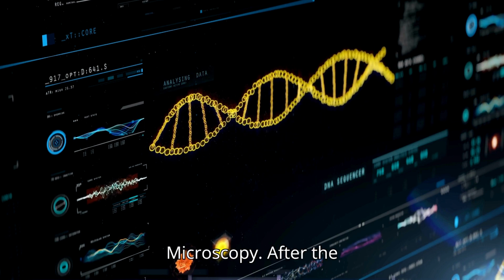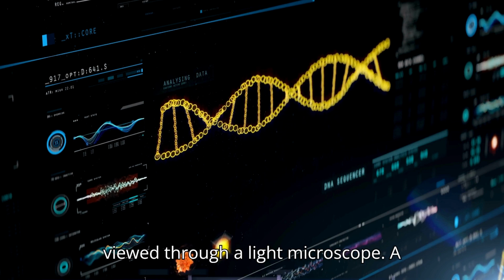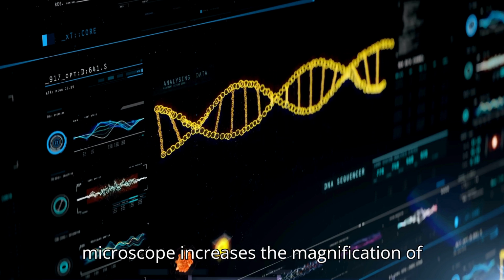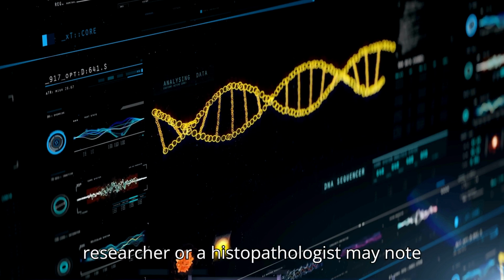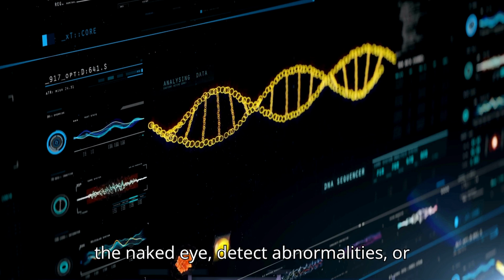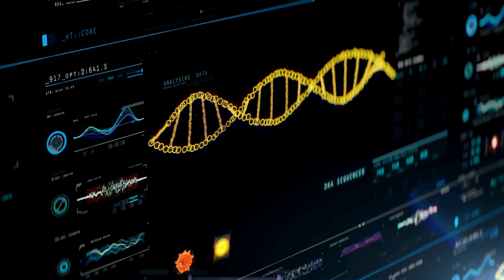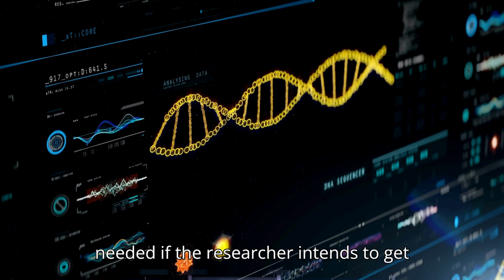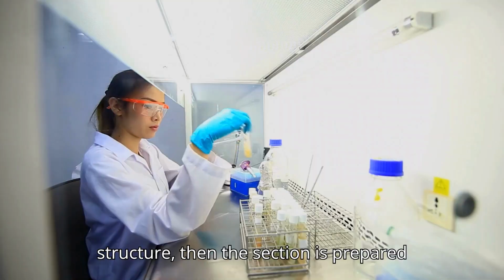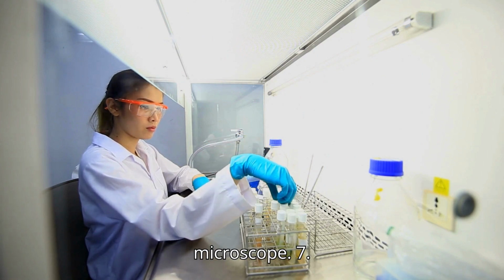6. Microscopy. Light microscopy: after the tissue sections are stained, they are viewed through a light microscope. A microscope increases the magnification of the structure, and, therefore, a researcher or a histopathologist may note characteristics that are not visible to the naked eye, detect abnormalities, or appreciate its architecture. Electron microscopy: if needed, if the researcher intends to get further details about the cellular structure, then the section is prepared for electron microscopy, which yields much clearer images than the light microscope.